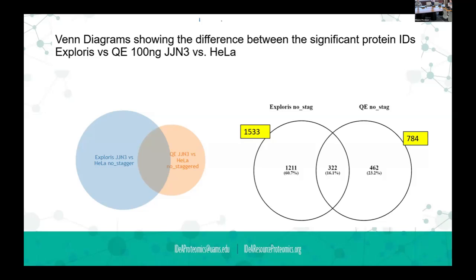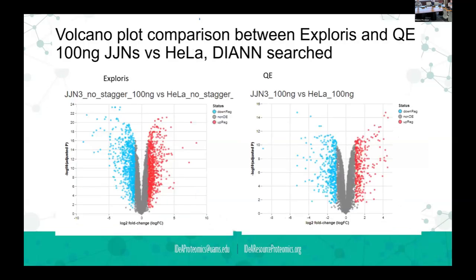So I did as all scientists do. I verified this by doing this again. So here's the volcano plot of the difference between the Exploris and the QE. And there is one interesting data point sticking way out there.